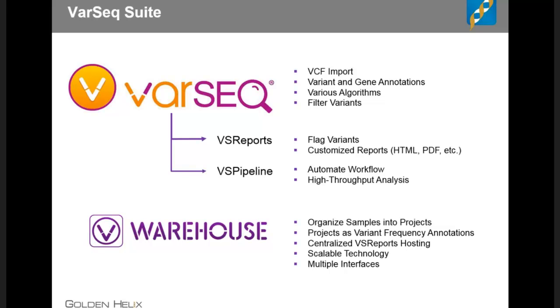Once you've created projects within the VarSeq desktop application — either manually or via the automated pipeline — our warehouse functionality can organize samples into projects, create variant frequency annotations, and centrally host completed reports. With the warehouse you can ask questions like: have I seen a particular variant before, and at what frequency? Or have I reported this variant in a clinical report, and what was the determination? The warehouse has extremely scalable technology and multiple interfaces. Today we'll focus on the desktop application plus some reporting functionality.